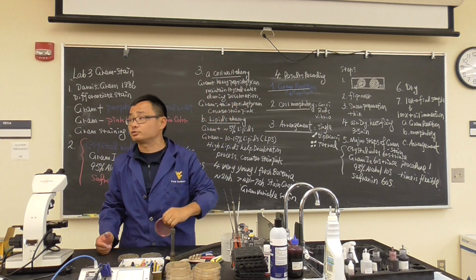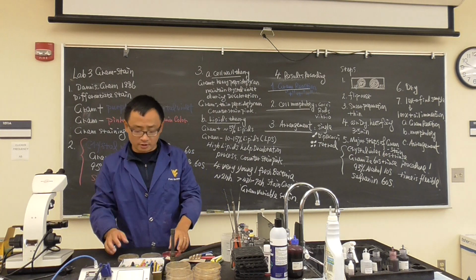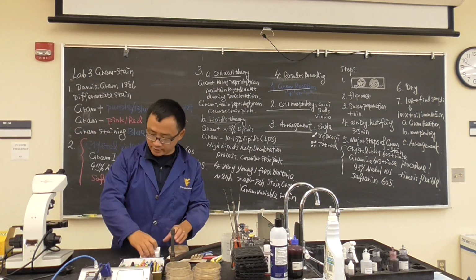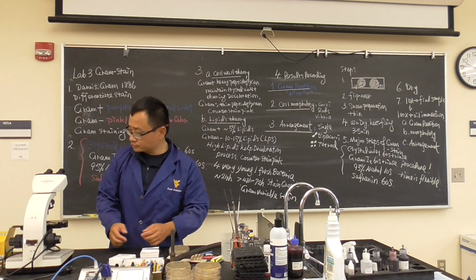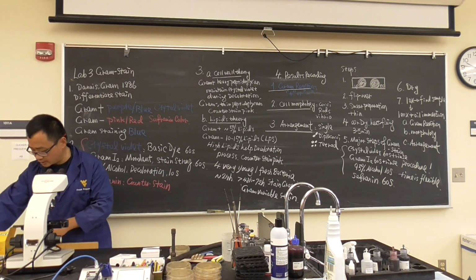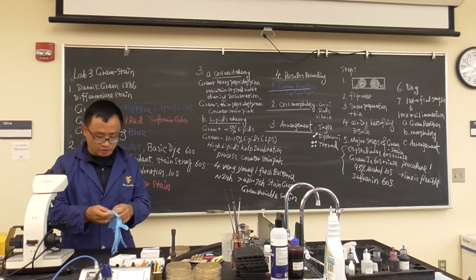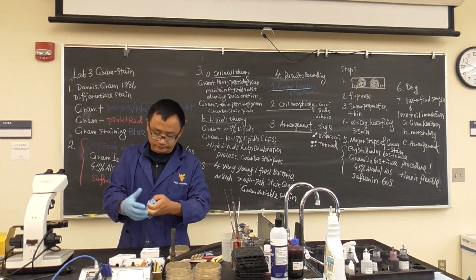So I will make 3 as an example, and you guys make 2. Okay? So again, we're using one of the steps as an example, then we go back to your observation. Okay? So the same thing, I'm going to have my gloves ready. And then we're using one of the benches as an example, and then we'll do the demonstration for you.